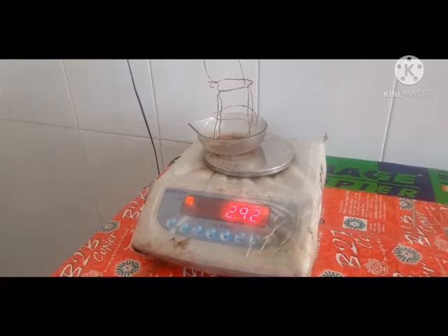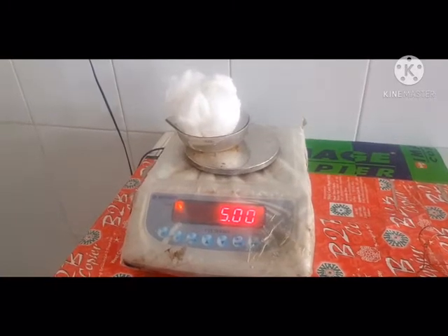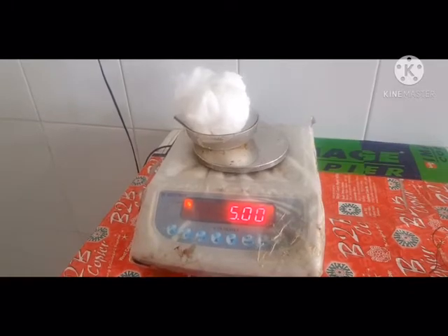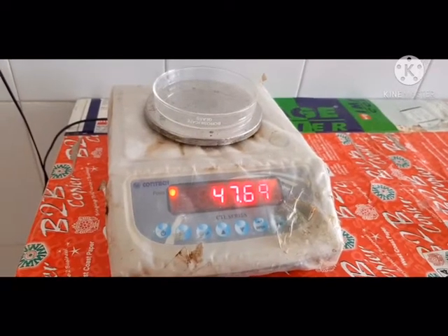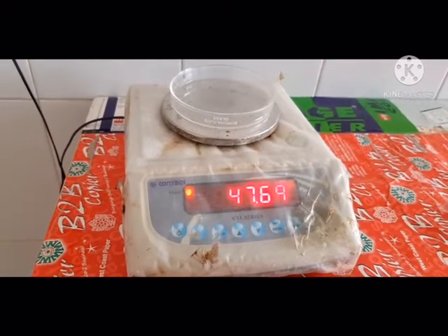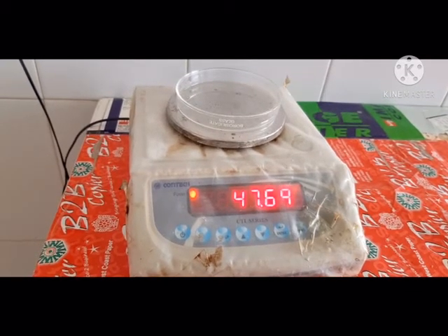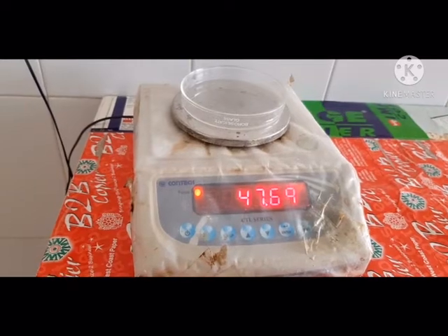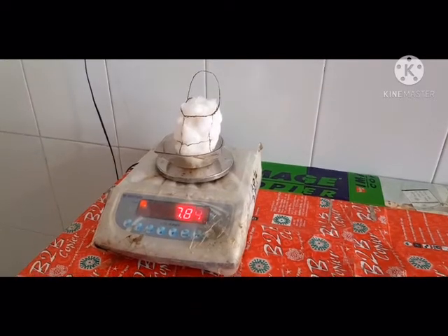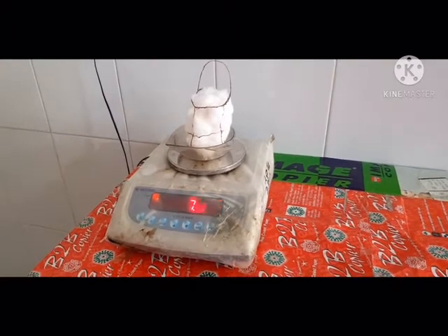In the procedure, accurately weigh 5 grams of absorbent cotton. First, record the weight of the glass porcelain dish, which is 47.69 grams. Then weigh the packed basket with cotton; the weight is 7.89 grams.